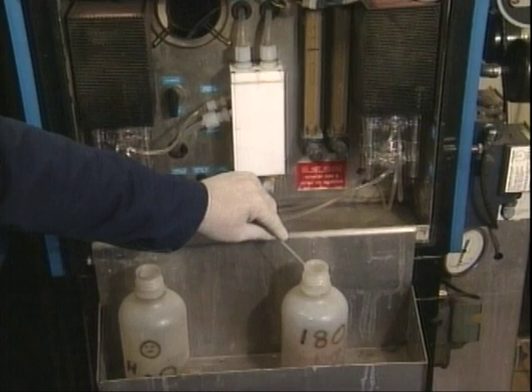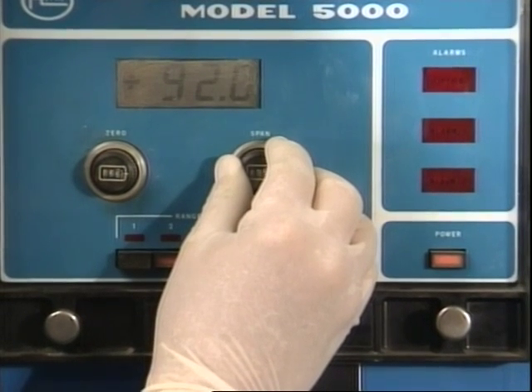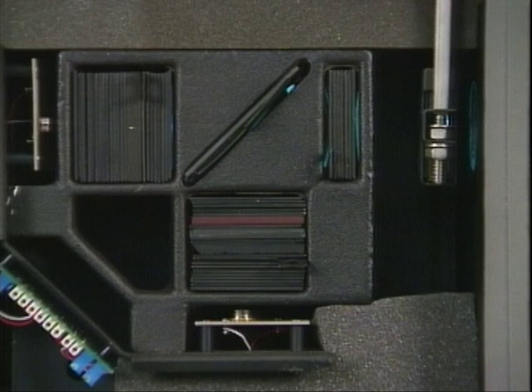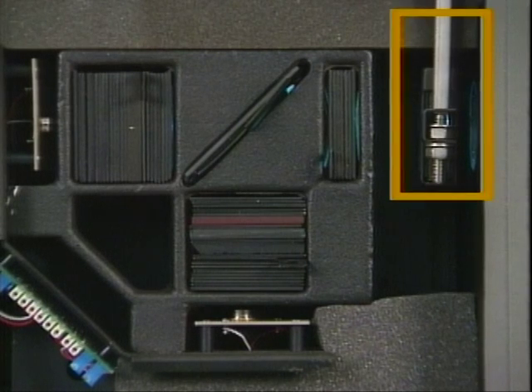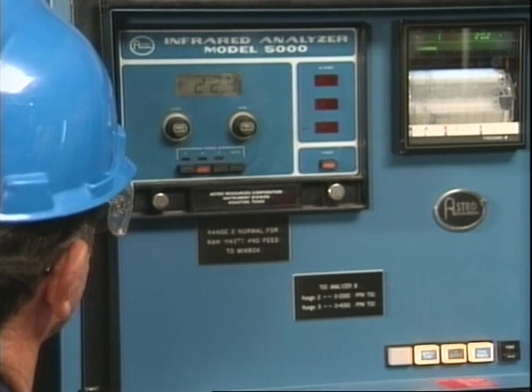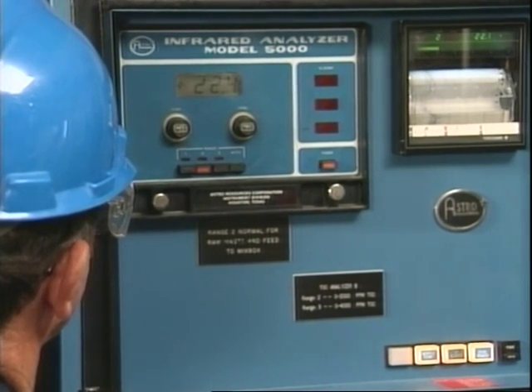To check span, add a known concentration of the analyte of interest to the zeroing gas and take a reading. The reading should match the known concentration. If it does not, adjust the span as necessary. In some analyzers, a calibration filter simulates the span sample. However, the sample cell should be emptied and purged in preparation for this procedure. After calibration, restore the analyzer to service and record the calibration results in accordance with your facility guidelines.